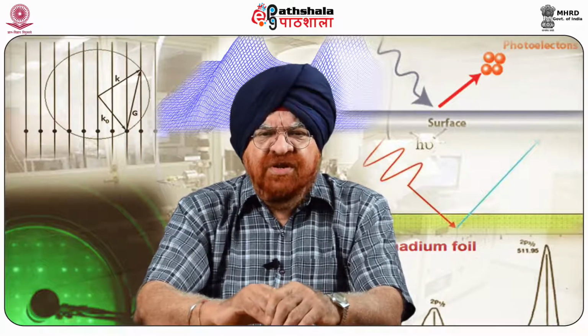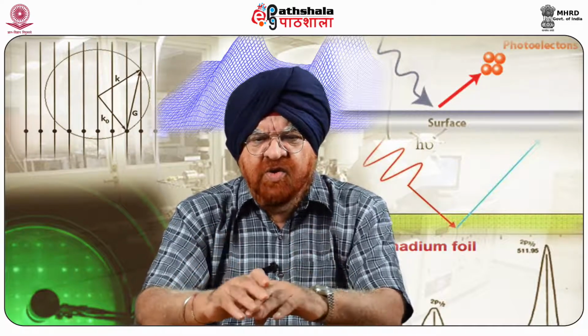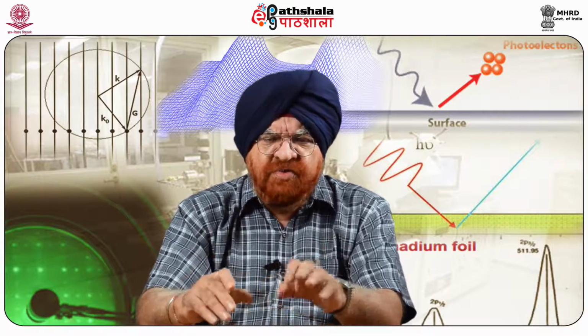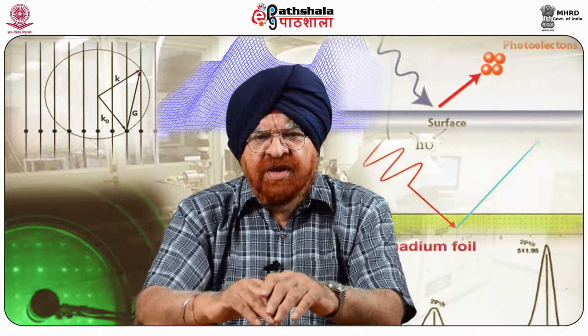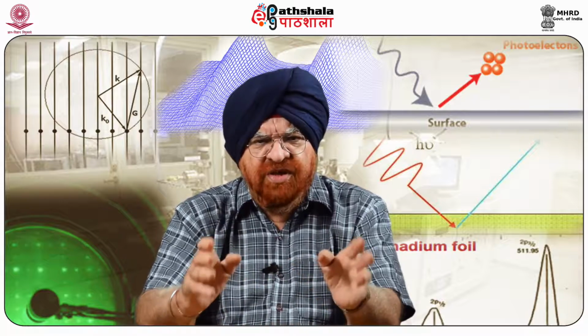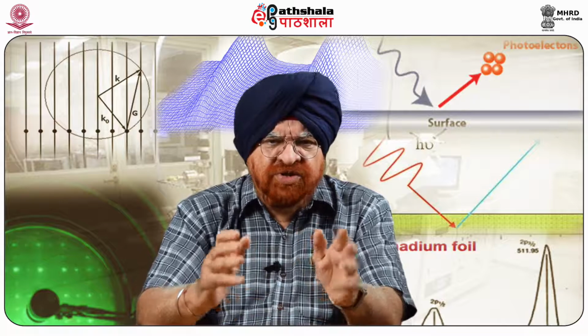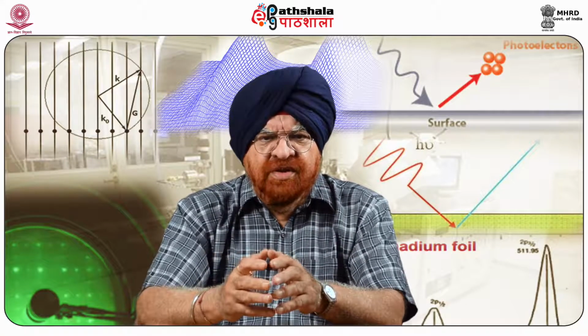Such interfacial electrochemical studies have dramatically expanded over the past decades. That means the use of this equipment has expanded a great deal, and anybody who is working in the area of electrochemical sciences is making potential use of this equipment.